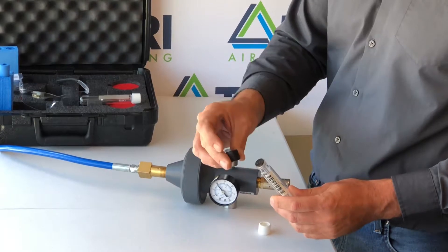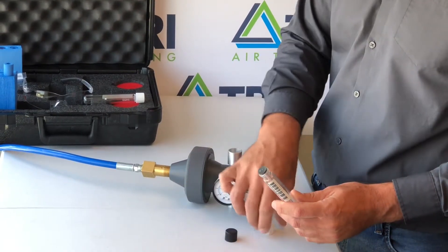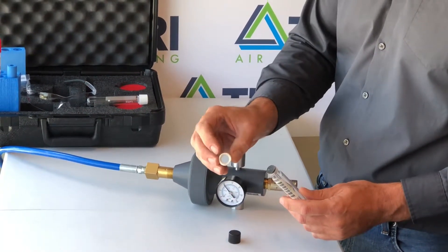To collect your sample you need to remove the shipping cap — the black cap — and install the white sampling cap with the center cut out.